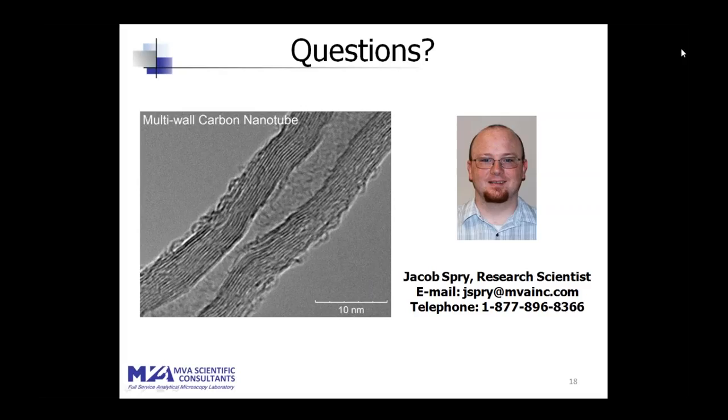In fact, we are building a high resolution TEM imaging database where we are going to upload all of our high-res images on an online database. Once we have that, we will let people know to go browse around.